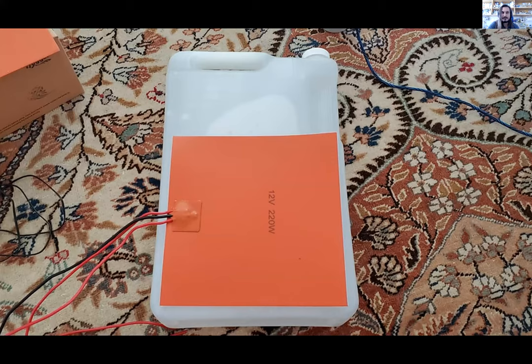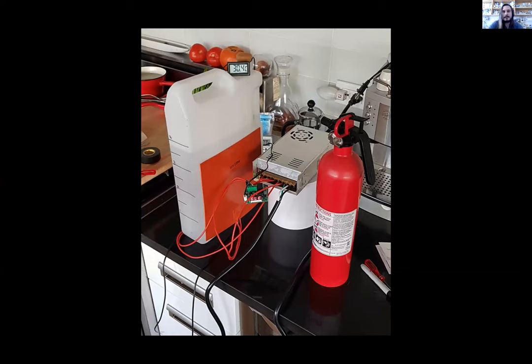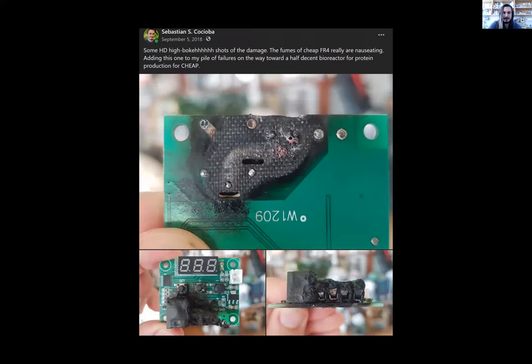And one of them is selecting your driver in a way that actually tolerates the amount of power that goes through this thing. And so, okay, I bought a thing on Amazon that was rated at 40 amps, and I'm just like, okay, 38 amps is lower than 40, this should be fine. And immediately my mom's like, you're going to need this. So she gave me a fire extinguisher, we put it in there, and we let it run for about an hour. And of course, an hour later, the thing caught fire. So this tiny thing that was rated for 40 amps is actually rated for 20 amps. I did a little digging, and the chip is rated for 20. So they're improperly selling it.